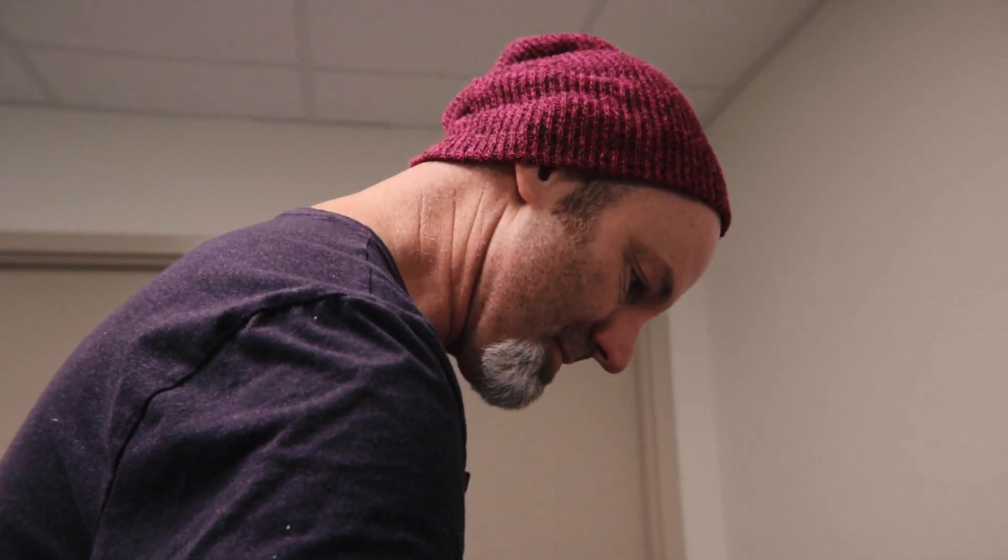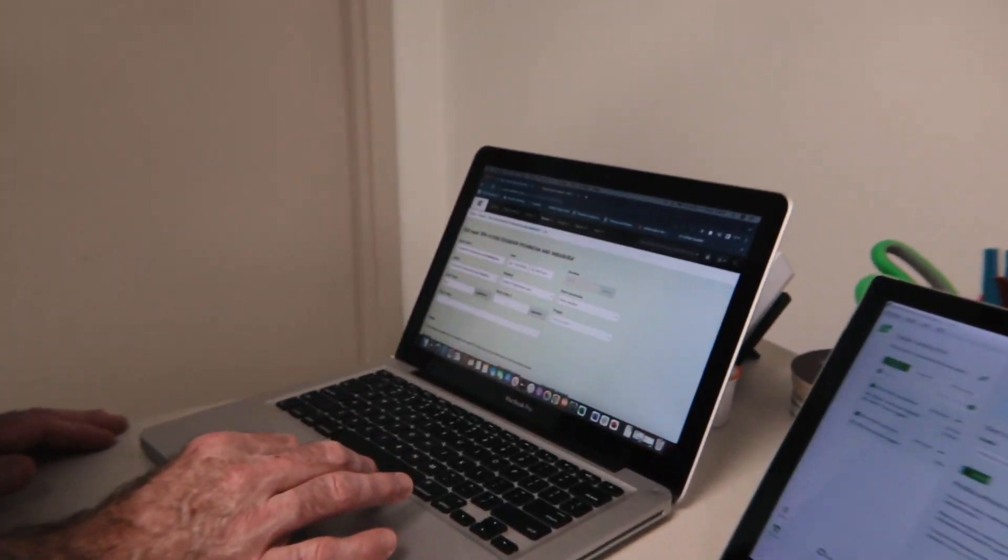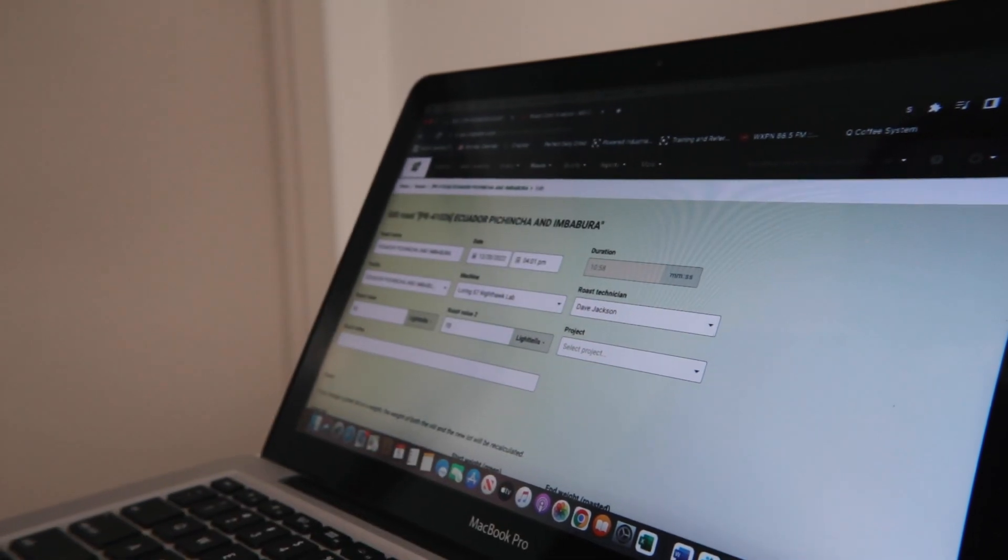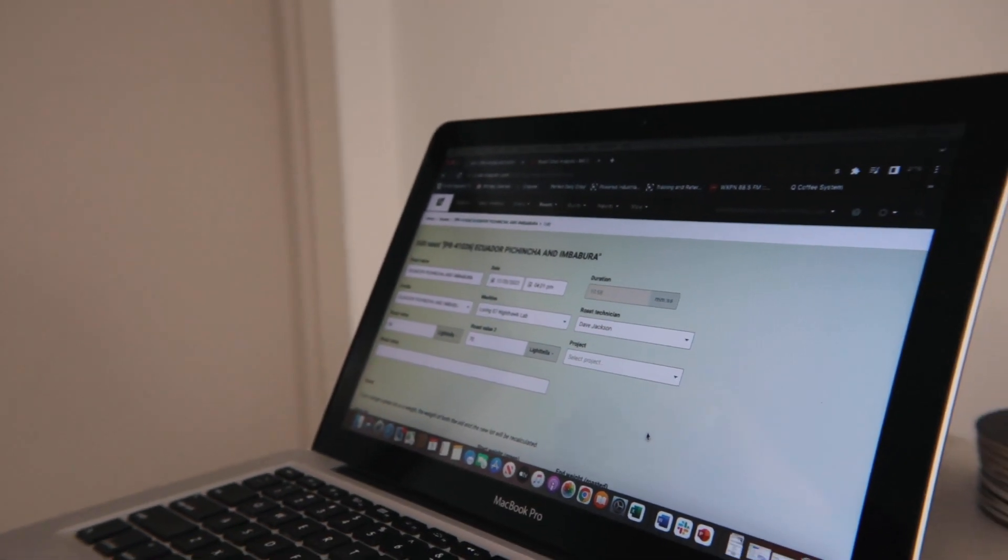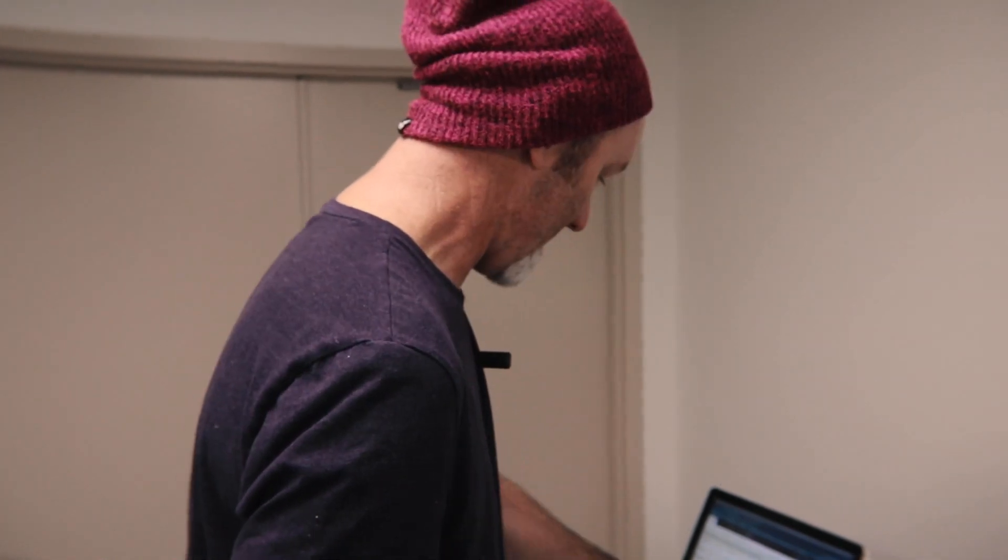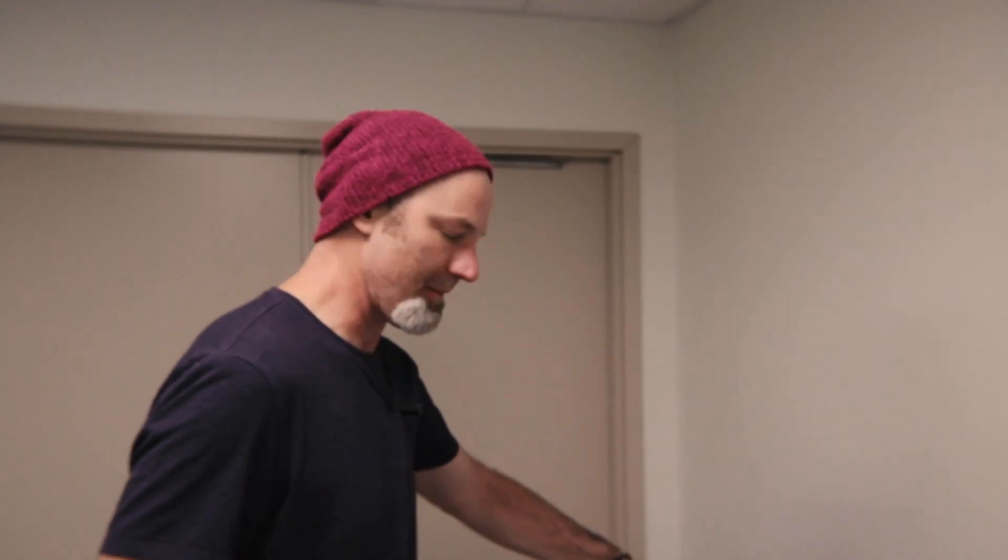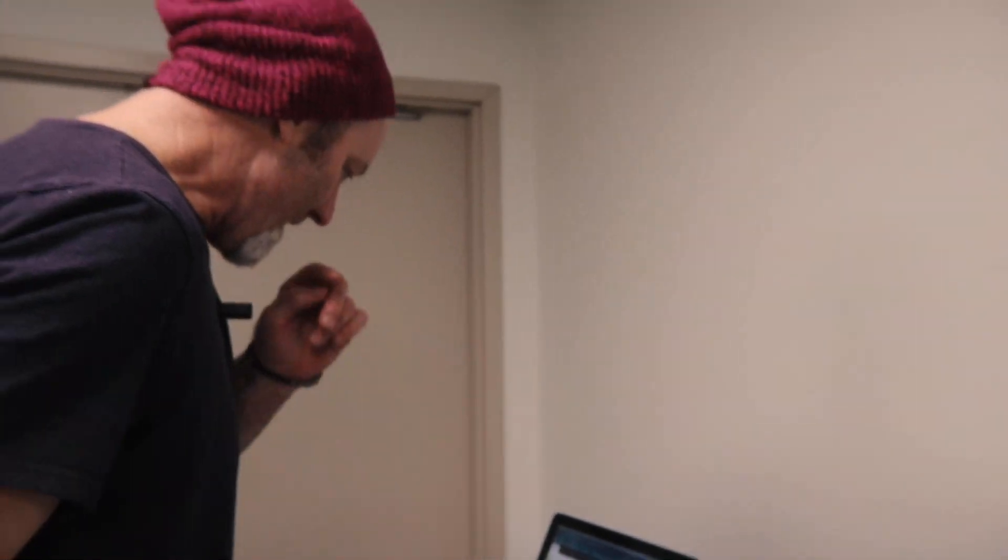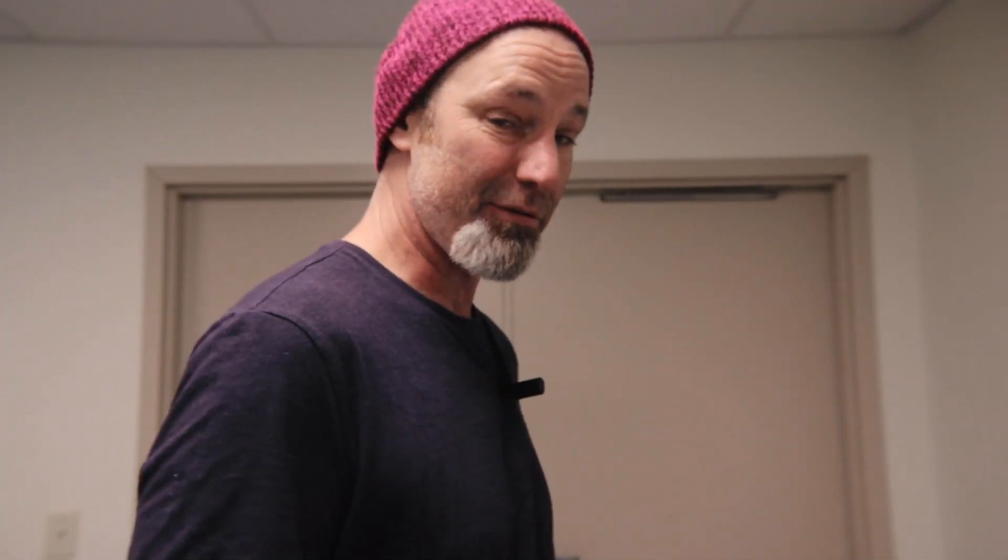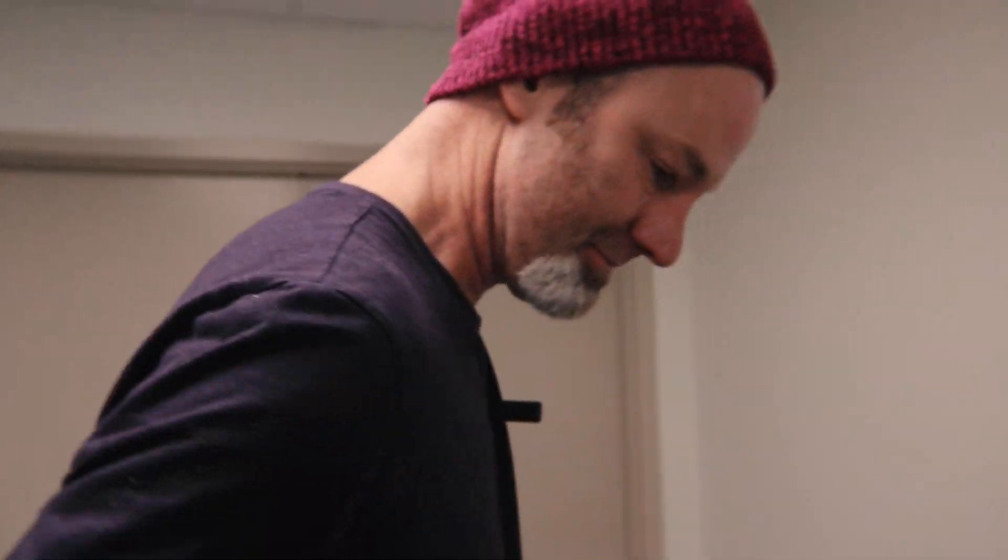So my second value, I'm going to plug in about 70. That way, the next time we roast this, we'll do the same thing. We'll do a cupping and I also already cupped and analyzed this one. We'll do the cupping and then the roast values, and then we'll have all that information. The next time we do this, if anything is off, we've got that data and we'll find out what went wrong.